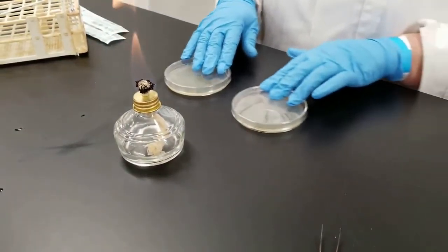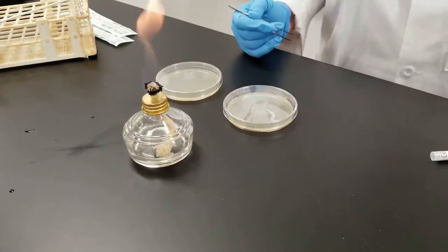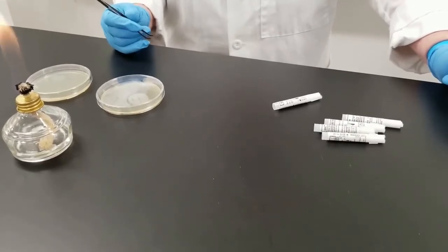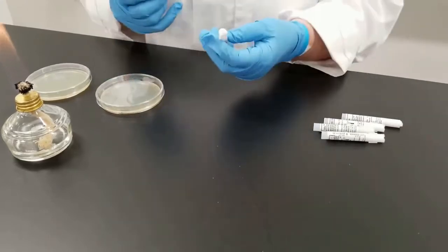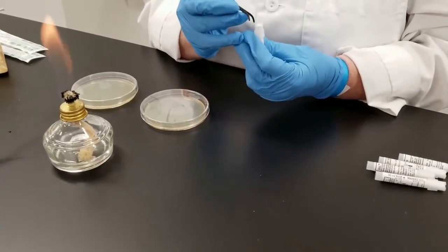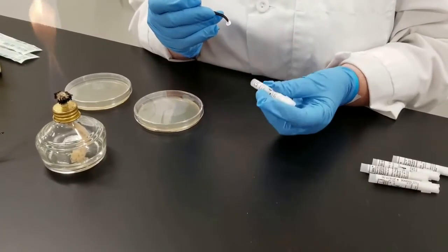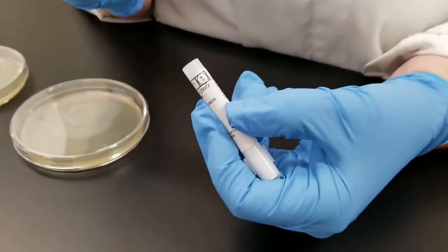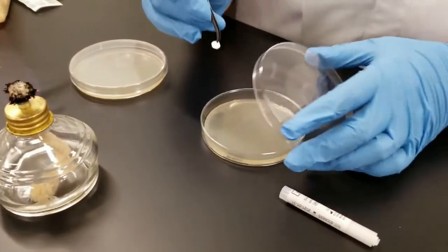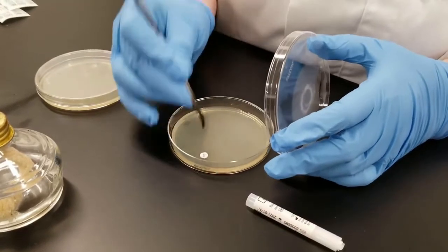So now that the plates are inoculated and they have been previously labeled on the bottom, we're going to arrange 5 different antibiotics on this. I'm using vancomycin, Bacitracin, Tetracycline, Erythromycin, and penicillin. Some places have little dispensers for these. We're just going to use the tried and true method of getting the disc. When you do this, on the side of the tube, on the label, there will be the name and the code number. Make sure you write that down so you know which one you are working with. So this one is Bacitracin. You're just going to put it on the plate and just gently tap it. Don't smush it down, just gently tap it.